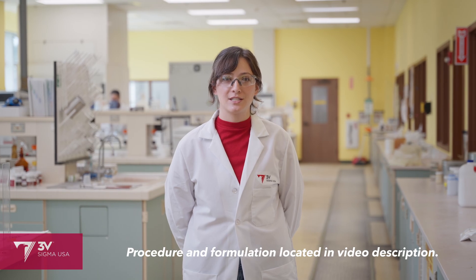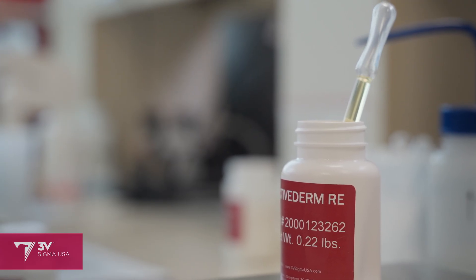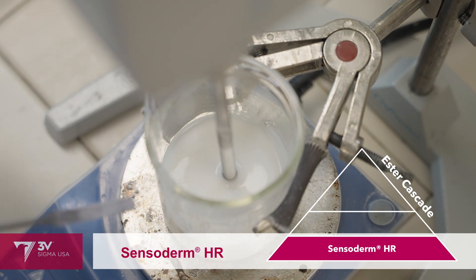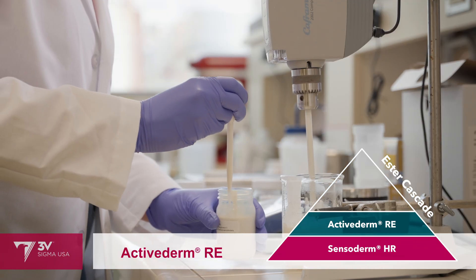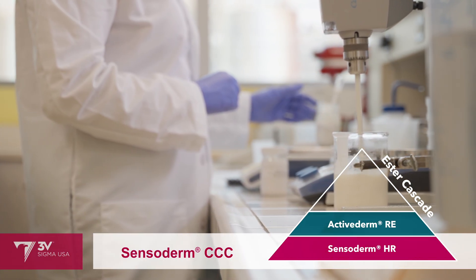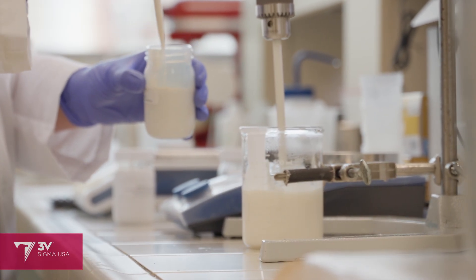For the sunscreen we're making today, I wanted the emollients to impart a creamy, cushiony, soft feel with moderate glide and high antioxidant activity. So for that I chose Sensoderm HR, Active Derm RE, and Sensoderm CCC. Sensoderm HR is a firm rice bran butter contributing a velvety richness to the cream without going in a waxy or greasy direction. Active Derm RE is one of our skin benefit emollients with gamma-oryzanol content and added tocotrienols, which scavenge the free radicals induced by UV irradiation of the skin. And then Sensoderm CCC, which is coco caprolate caprate, is a lightweight emollient with dry oil feel that improves spreadability of the minerals.